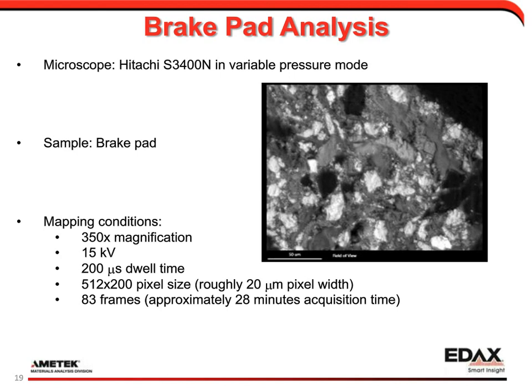We let a little bit of air into our analysis chamber, and since we have higher molecule density in there compared to a high vacuum, we see more scattering of the electrons that are coming down through the column. And this can have a significant effect on the spectrum. We should be a little careful when we're applying variable pressure mode, because you can get signal from areas that are quite far away from what you think you're looking at.